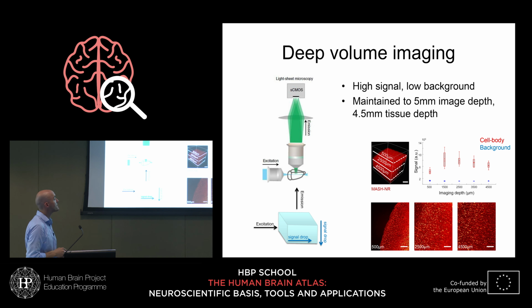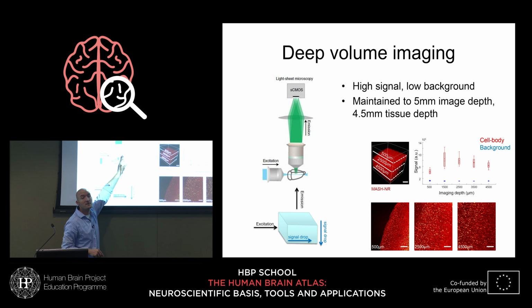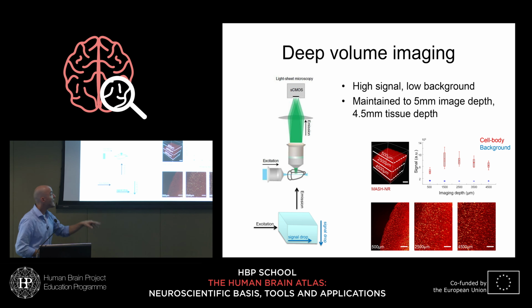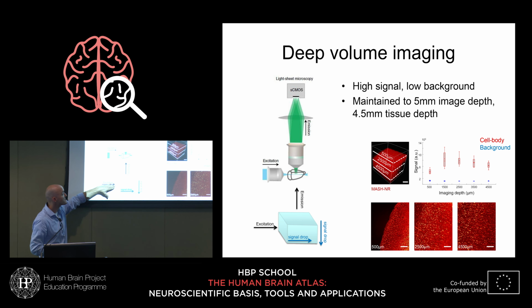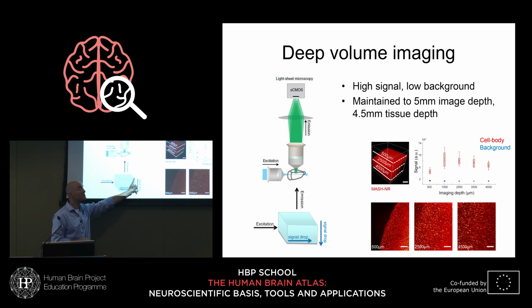And that's very important because with light sheet microscopy, where you send a sheet of light in from one side of the tissue, and then you detect on a CMOS camera on the other side of the tissue, and you detect an entire plane at the same time, and then you go deeper, entire plane at the same time, you have that loss, that scattering, both in the excitation, right? Signal drop goes in the excitation direction. Here, signal scatters more and more and more, and there's less excitation here. And you have it when the signal travels out in the emission, because it has to travel through more and more tissue here, so that signal will also drop in that direction.